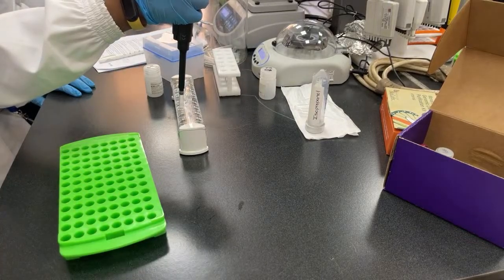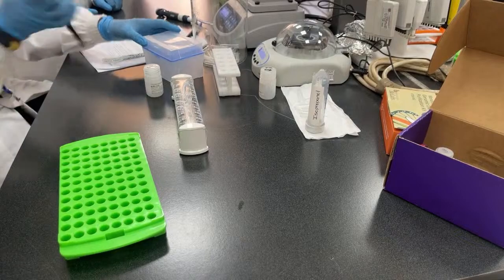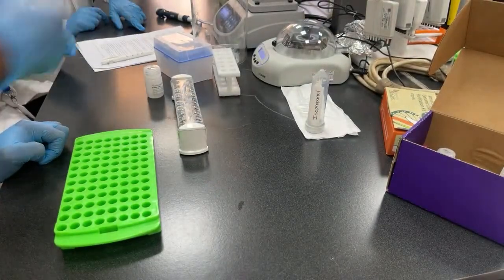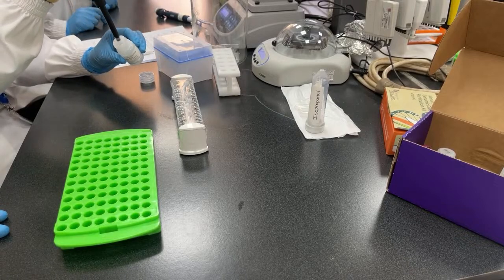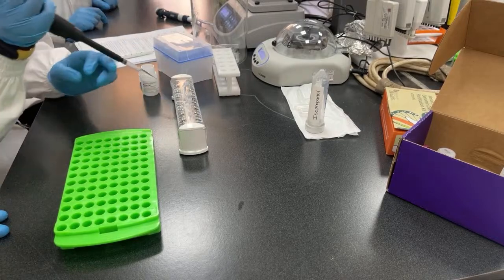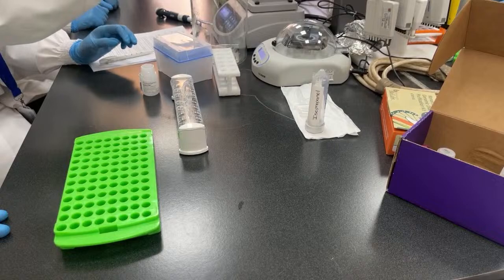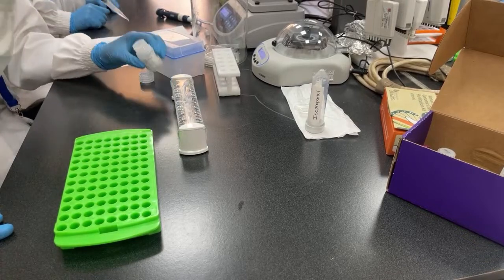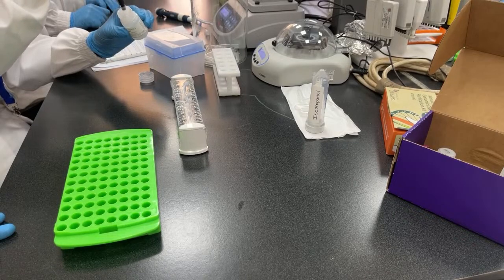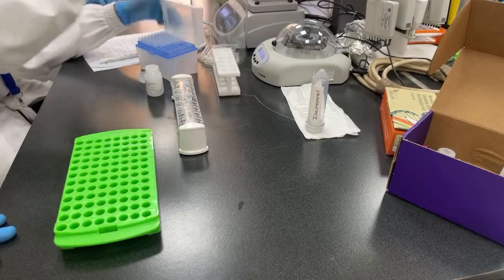Add 500 of CW1 with the step. Because we are repeating the step, add W1 and add again 500 of CW1. You can just add straight, you don't need to, because we're going to mix it again. We are now repeating. Then repeat again.